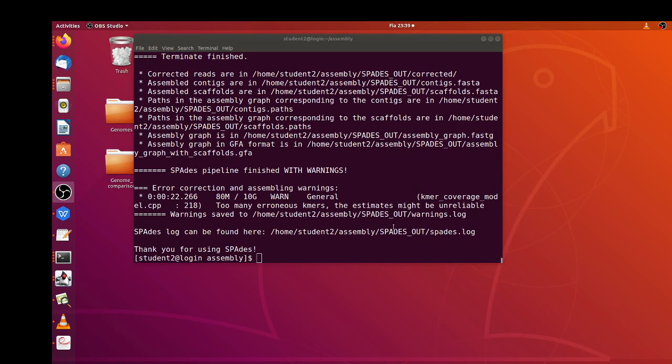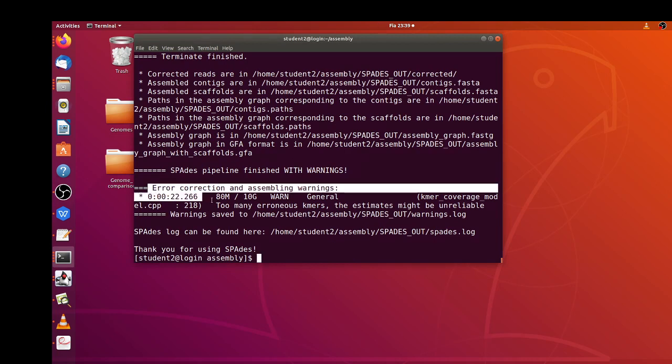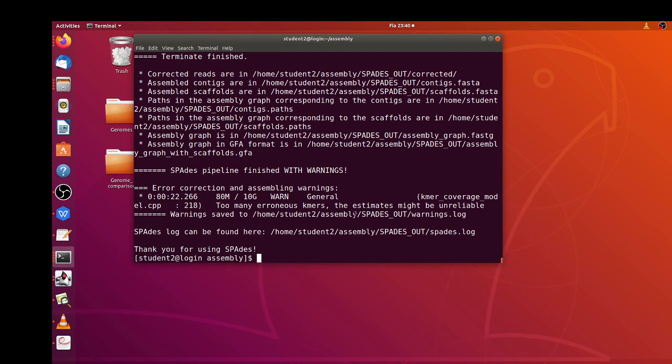Okay, so now our de novo assembly is complete. Of course sometimes it gives warnings, as you can see here it says error correction and assembly warnings. Some of these errors you might want to look into, so you can ignore them depending on your research questions. Of course sometimes you can also consult other bioinformaticians to get their view on some of these ones. But this was just a demonstration of how you can perform de novo assembly, so I wouldn't go into those technical details.